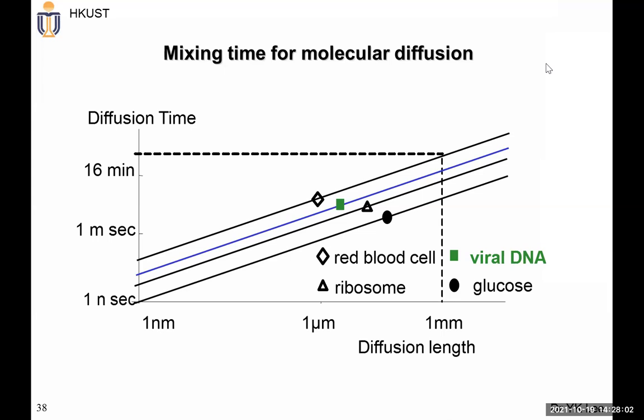In a traditional large-scale machine, all the biochemical reactions for separation or detection are diffusion-limited processes, so it is much slower. But if you go much smaller, into a microfluidic device, you can minimize the diffusion time and diffusion length scale, so it can be faster.